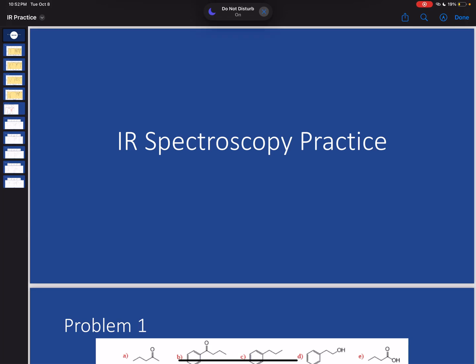Hi everybody, so here are some videos just looking at IR spectroscopy. You guys have asked me for a couple of those. This is kind of weird because all I'm really going to do is show you what I do when I look at an IR. There's no real video for me to make about it other than just showing you what my techniques are when I approach this.